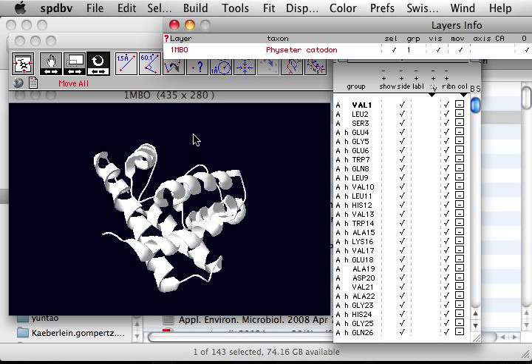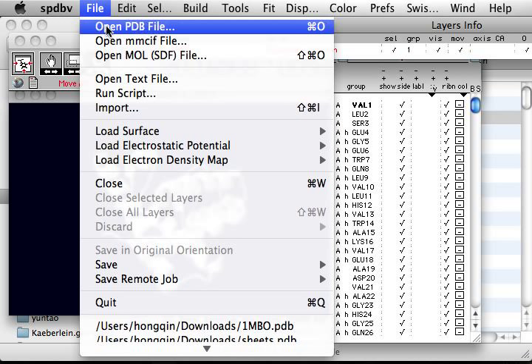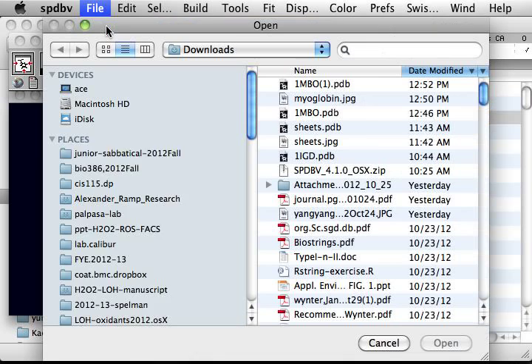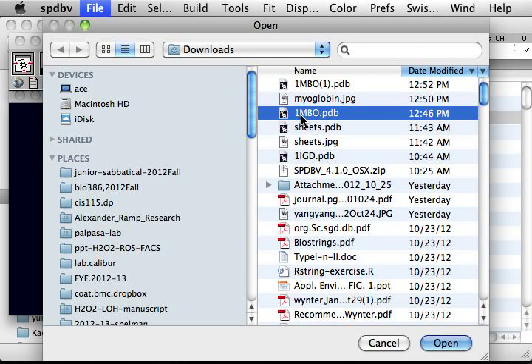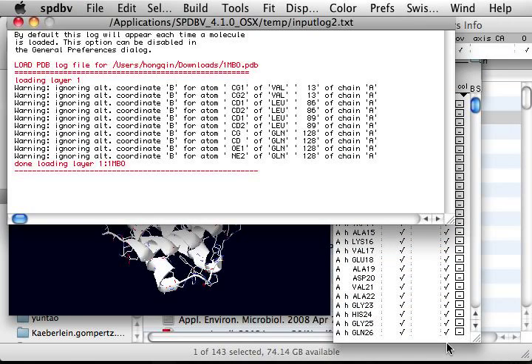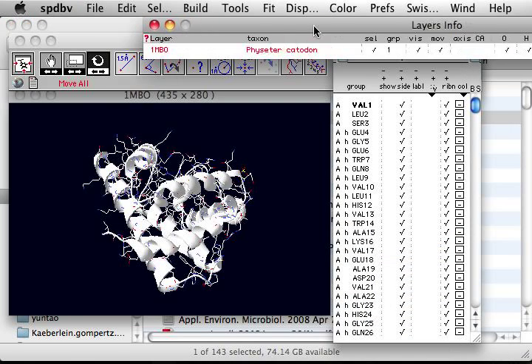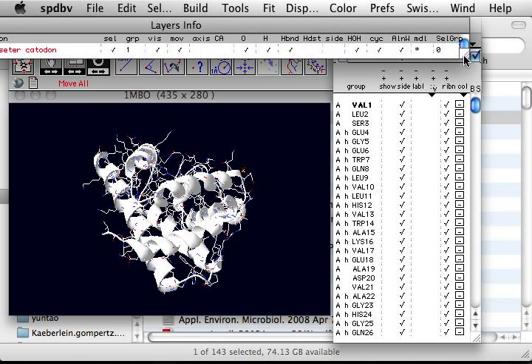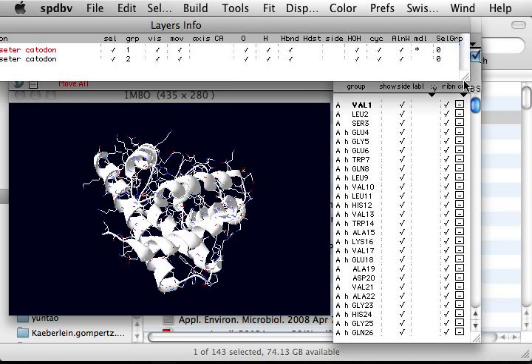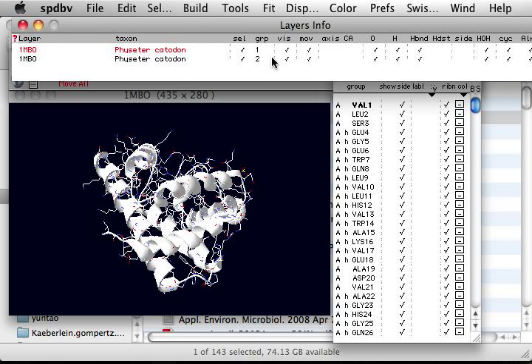Now we want to add another layer to show the heme structure in the myoglobin. Go to File again, open PDB file, and open the 1MBO.PDB file again. Now if you look at the layers window, you see there are actually two layers.